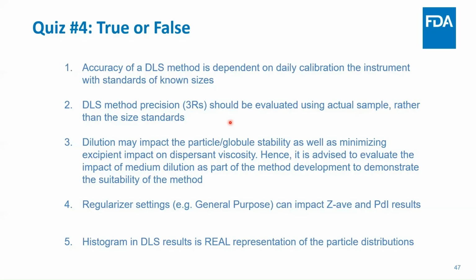So, last quiz for the day. Accuracy of DLS is dependent on daily calibration with known size standards. Does anybody think that that's true? Let's throw some T's or F's in the chat here. I'm going to wait until I see a couple more.